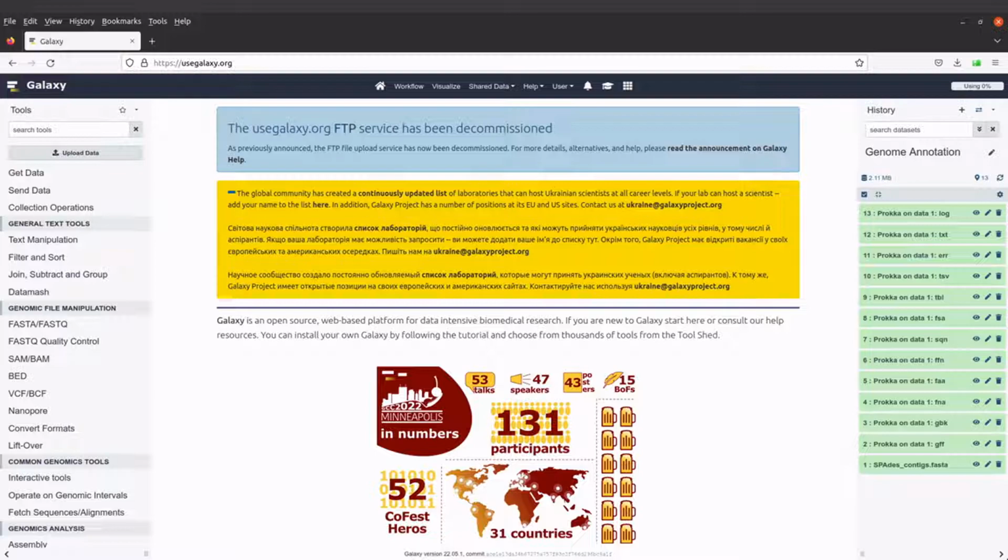So first of all, we need to select the files that we want to download. So we want to download files 2 to 13. So I'll first have to come to this side where the checkbox is. When you hover your mouse on it, you see the text select items. So click it, and then you have checkboxes appearing on the left side of all the files.